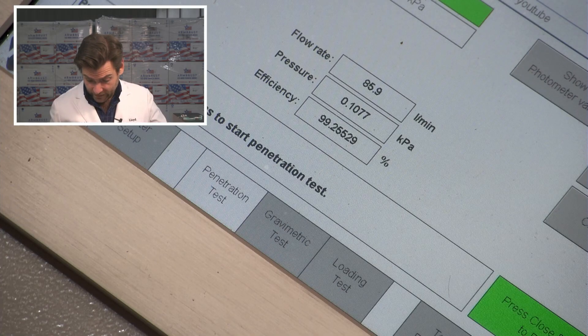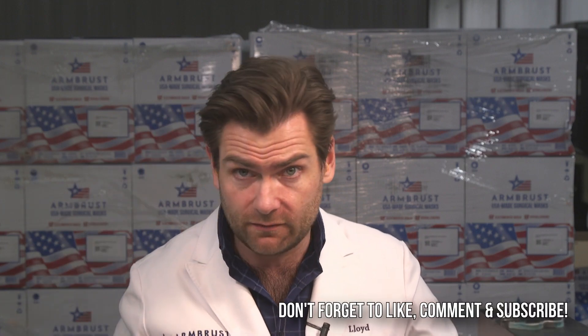What's that matter if it doesn't protect you? 99.25, 107.7 Pascals. I think there was a 3M KN95 that did almost exactly 107. So it's pretty good.